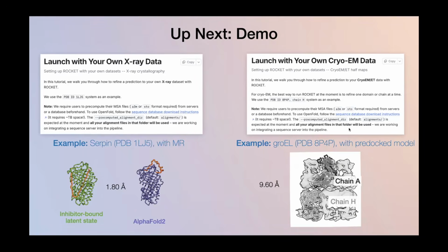And then we'll show similarly an example that's also in our preprint of a GroEL subtomogram average, where we recover the two chains from the two rings. And so I think with this, I'll probably pass the word to Min Huan, and then he can share his screen.